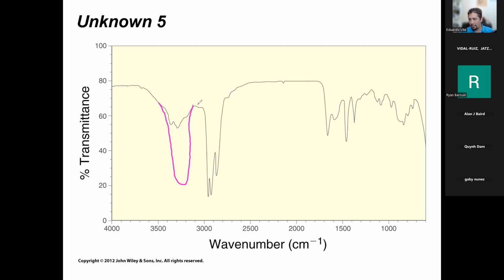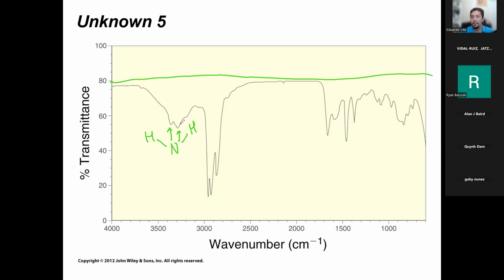And yeah, he's got the two peaks for the primary amine. Each one of these peaks corresponds to an NH. So this is NH2. NH, NH. That's why you have the two peaks right there. Notice the signal is in the same region as alcohol, but it's not smooth. It's also weaker, right? Medium, I would say, based on this. But again, look at the background. The background here starts at 80. So actually still weak, right? You do have to look at those things. But regardless, the peaks are where they should be.